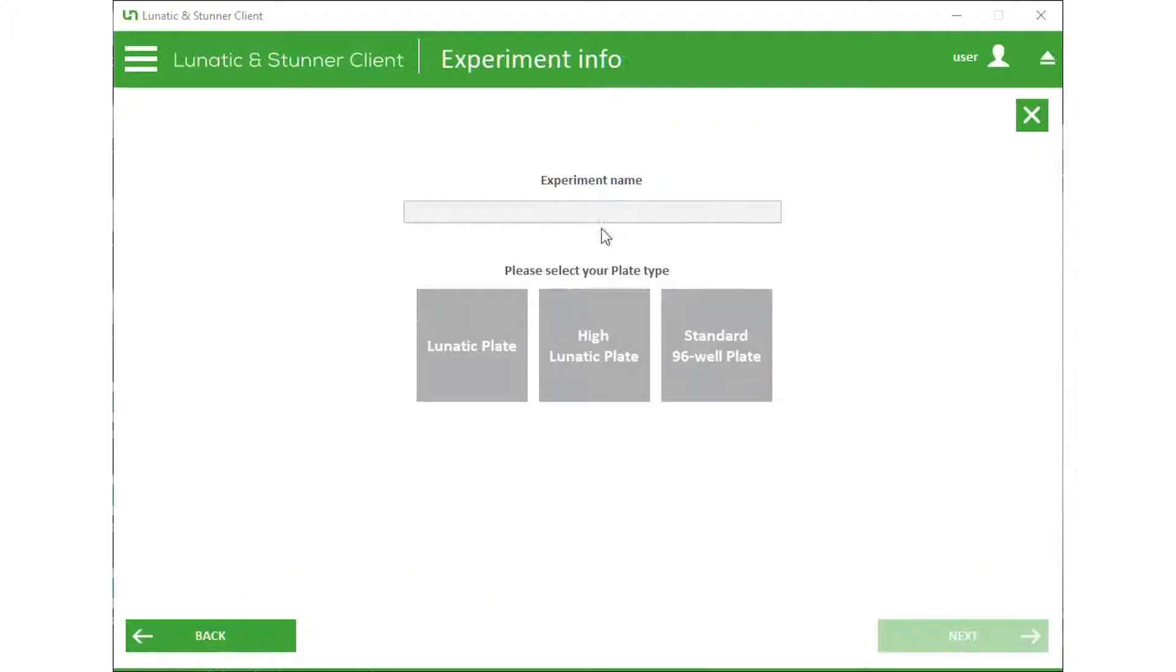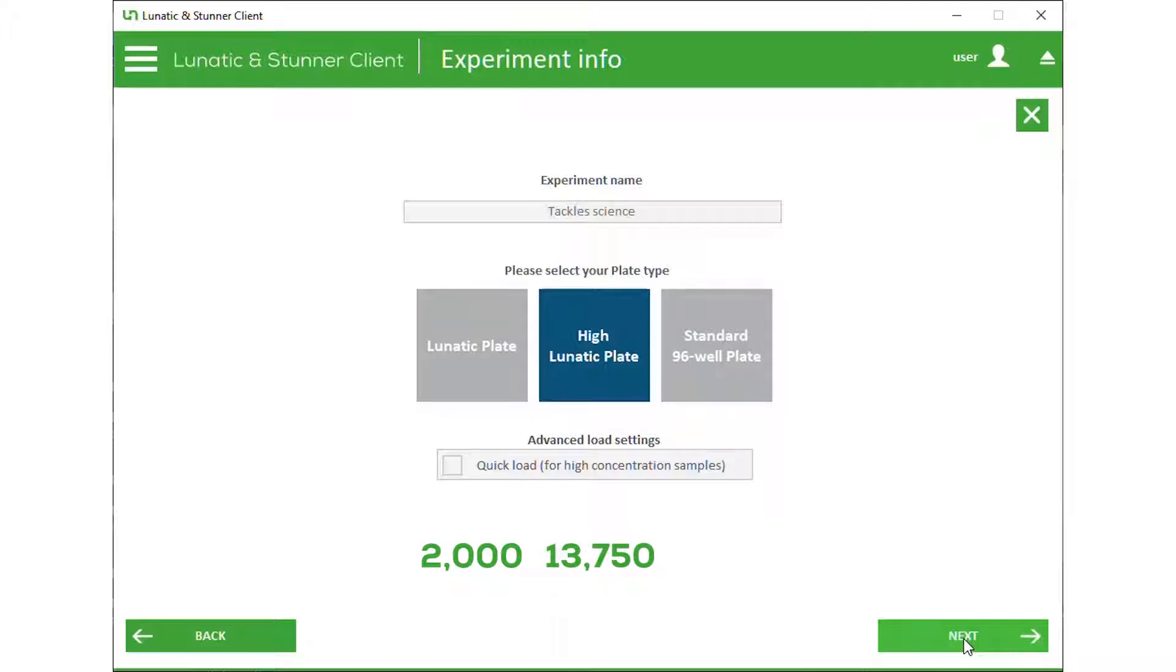Now we name the experiment and select the plate type. Lunatic plates have a maximum range of about 2,000 nanograms per microliter and high Lunatic plates have a maximum of 13,750 nanograms per microliter.